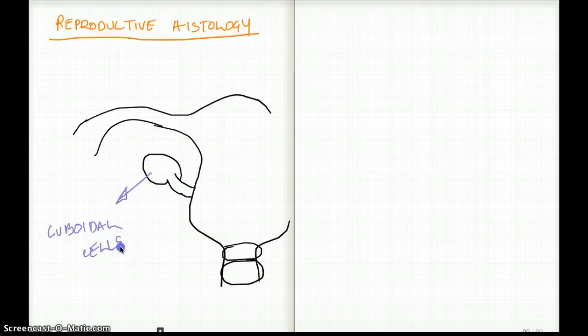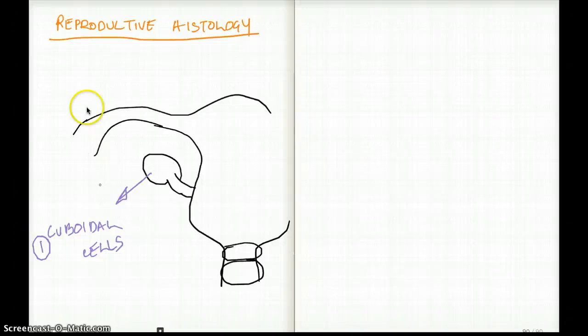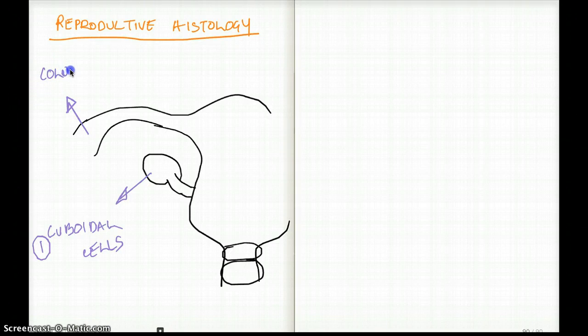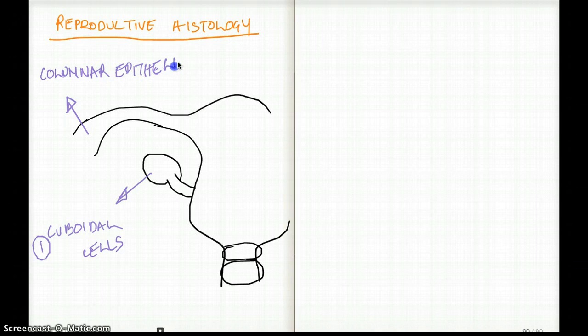So first we're going to see number one, cuboidal cells. And then now let's talk about the fallopian tube. Remember, it's a tube. A tube is like a column, right? So obviously, the next thing we're going to see in the fallopian tube is columnar epithelium. That's my number two.